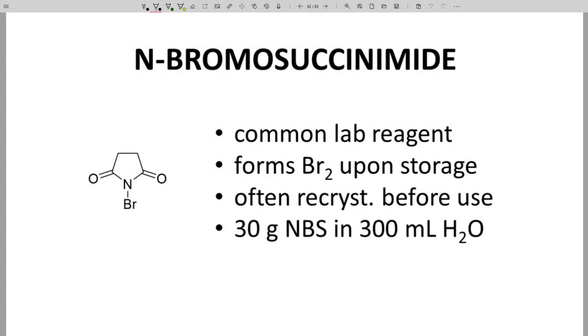We're going to demonstrate a recrystallization of N-bromosuccinimide. This is a common lab reagent that tends to release bromine upon storage. The impure material gains a yellow color. Researchers often recrystallize NBS before use, and the standard recipe is 30 grams NBS in 300 milliliters of water. A reference to this procedure is in the video description.